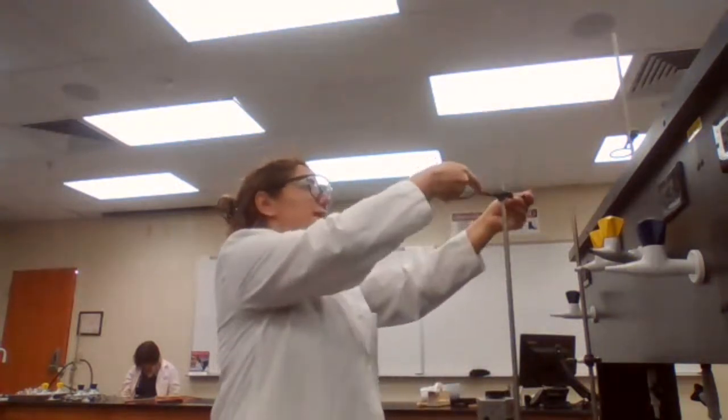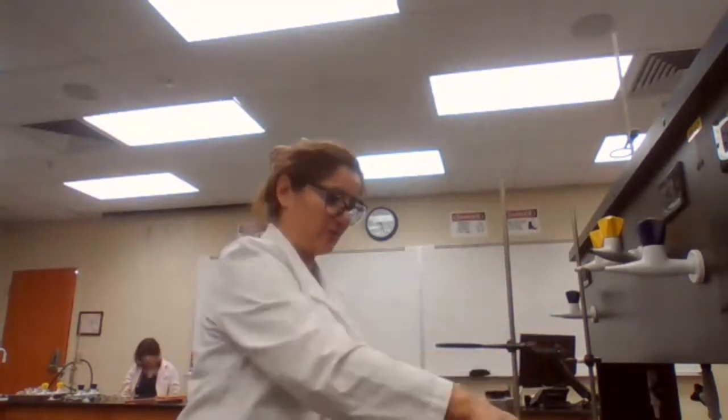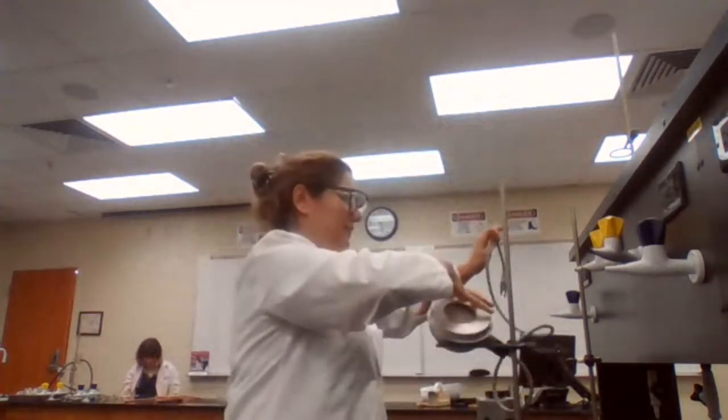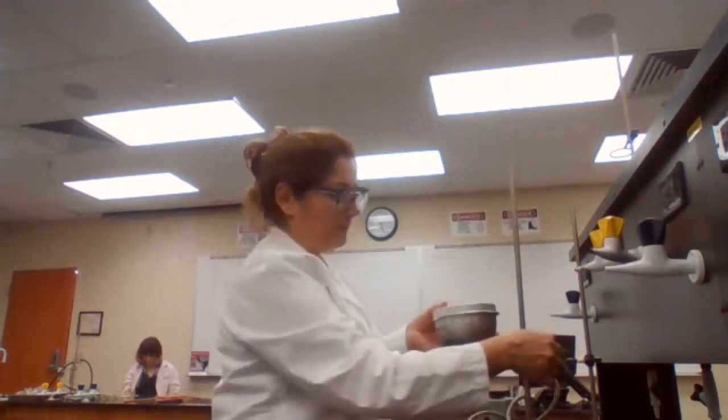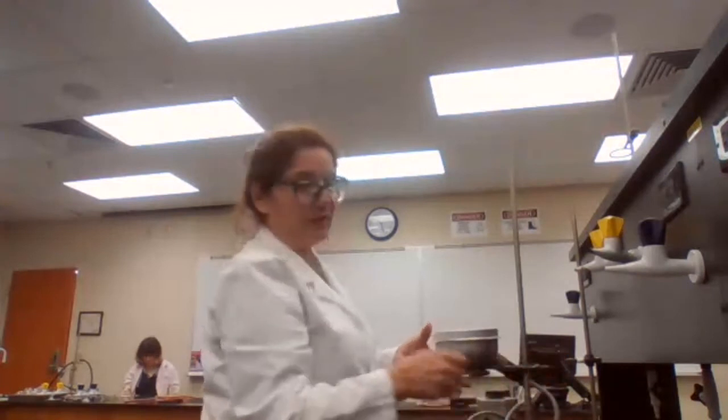Your hardware should be out. It's not the perfect and ideal situation right now. I may not have everything out on the table. I have to get the equipment for you to assemble it. But the hardware that you need, you see on the diagram on page 15 of the lab manual.